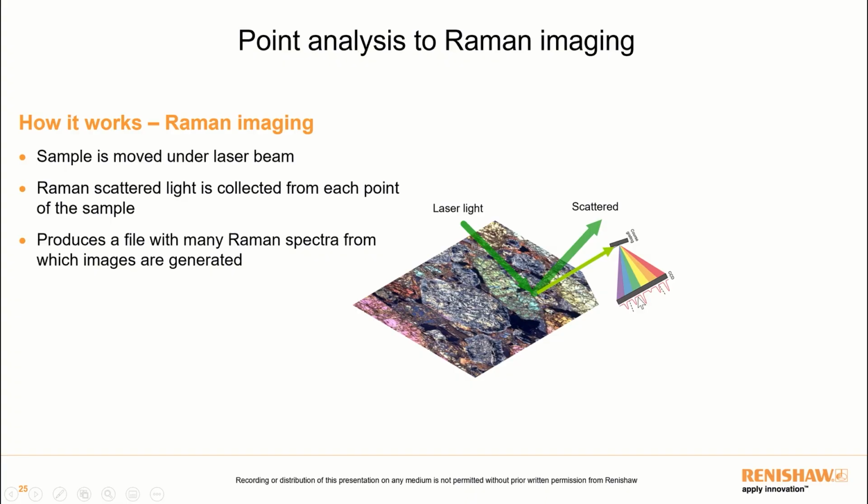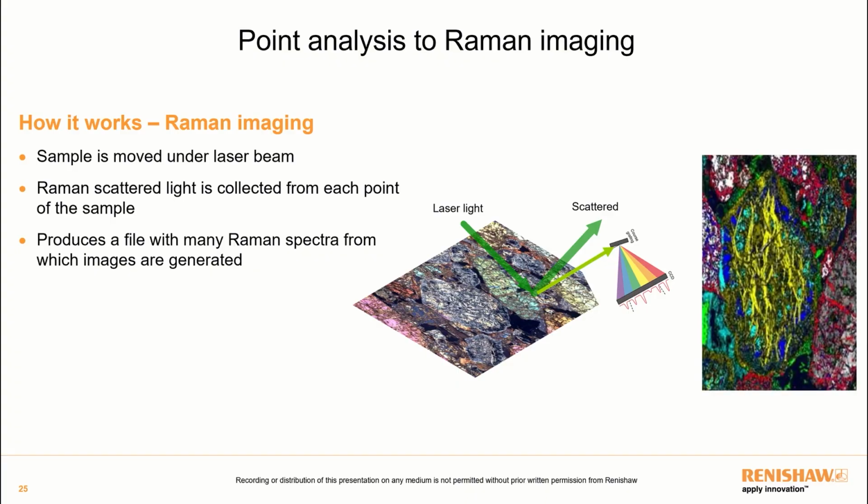When the spectral dataset has been created, we can generate from this a multitude of Raman images. These can be generated using univariate techniques.